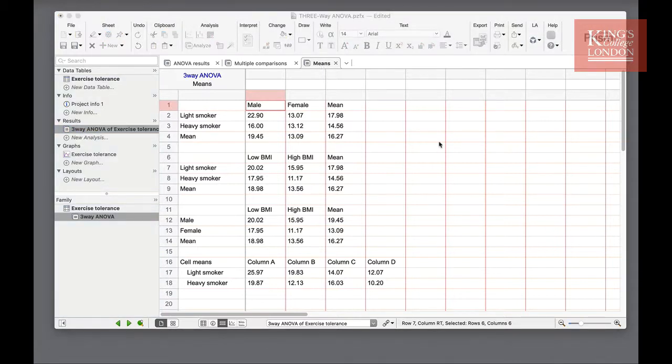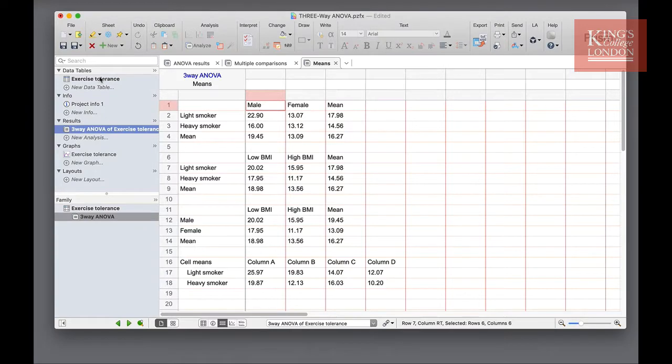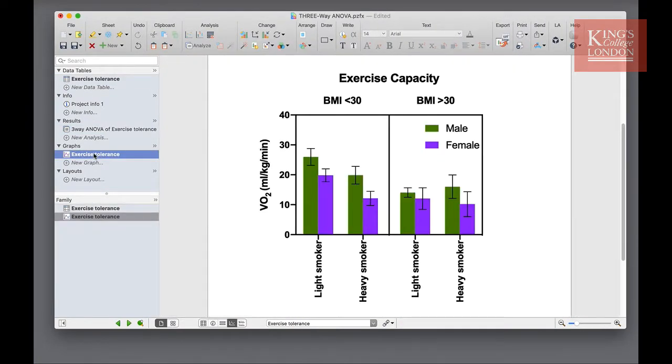So to summarize, the three-way ANOVA allows you to analyze your data when you have one measurement variable, in this case VO2 max, and three nominal variables, in this case BMI, gender or sex, and whether they smoke heavily or lightly. We enter our data table in grouped format and we can plot our graph directly from this table and carry out our three-way ANOVA directly from the same table.